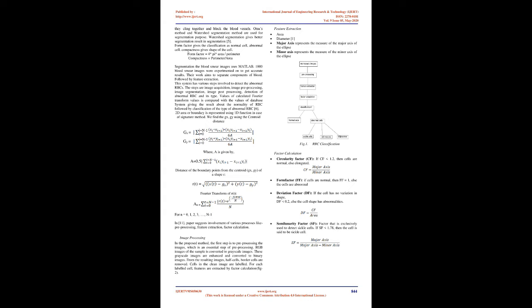2. Dilation 10. Addition of pixels to the image object boundaries. In a binary image, a pixel is set to 1 if any of the neighboring pixels has value 1. This operation makes objects more visible and fills in small holes present in the objects.